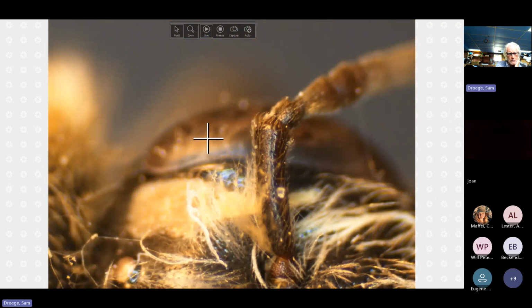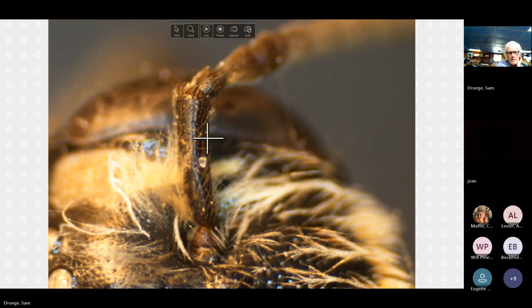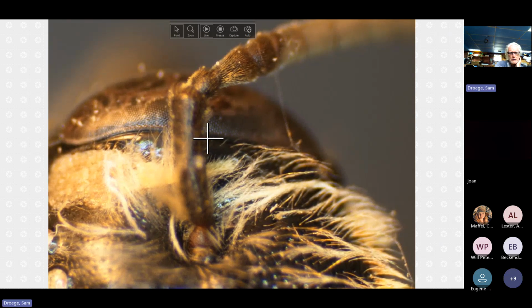A different angle. And we can get this impression again too. Here's a narrow fovea. Here, this fovea curves away. You can see the relative distances between the eye rim and the fovea varies, but at its greatest maximum, there's quite a gap. And if you think about many other Andrena, they largely follow the edge of that rim. There's really not all this variation going on.